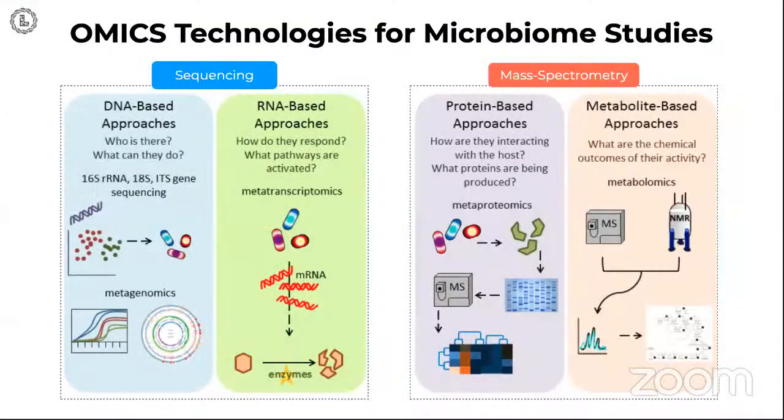How can the microbiome be studied? It can be studied with two primary technologies that are available today, sequencing and mass spectrometry. When we speak about sequencing, we can look at particular pathogens that are either isolated, or by sequencing everything that is in the microbiome and mapping it onto the reference DNA, or we can also analyze the metatranscriptome when we think about what products are going to be produced by these microbes. When we speak about mass spectrometry, we're really talking about detection of particular metabolites or proteins that could be analyzed by their mass composition. So we can look at these spectra and design assays to study what products are and what signaling pathways occur in these diverse and complex communities.